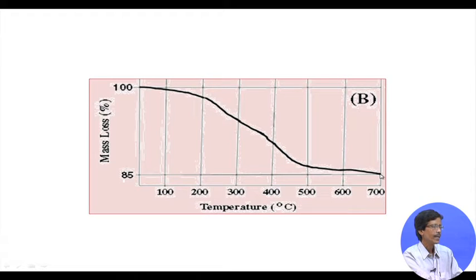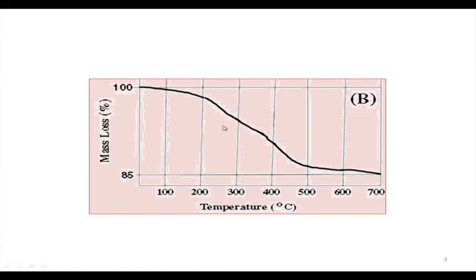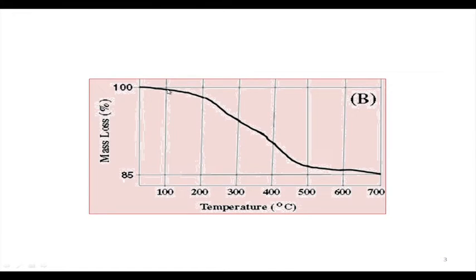But above 100, as we have seen and will again discuss for calcium oxalate and magnesium oxalate, in this particular case the typical staircase-like plot we do not see, because these are real samples. Sometimes we get this for metal complexes, polymeric samples, or other solid samples, where beyond 100 degrees centigrade there is a monotonic decrease, the weight loss is monotonously going down and only the slope is changing. After 100 degrees centigrade we get continuous weight loss till 500. After 500 it slows down until we reach 700.